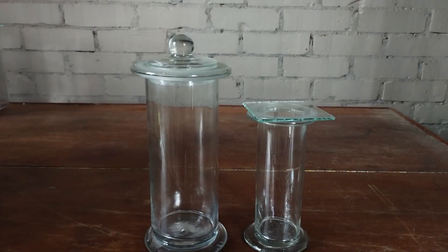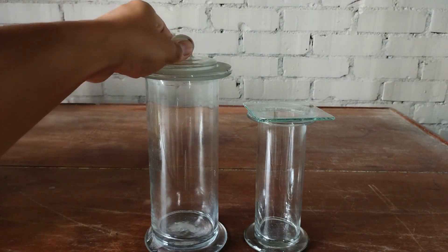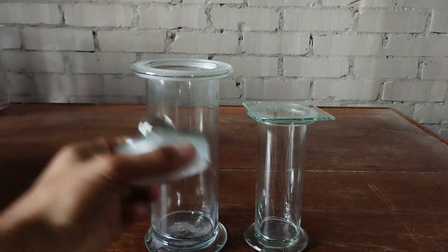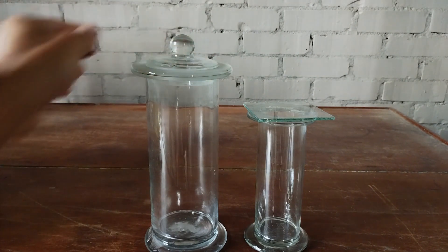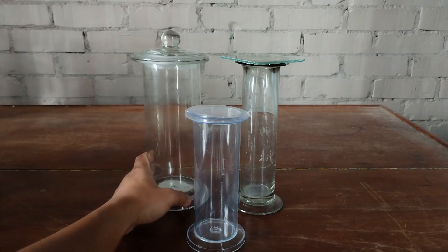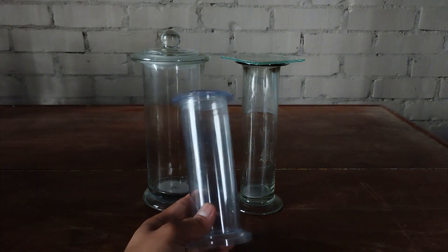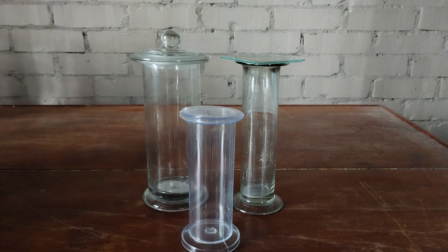There are also specimen jars based on the design of a gas jar where the cover is a more sophisticated kettle lid type design with a tight-fitting ground glass joint and a knob handle, like the one shown here. Most of the 19th and 20th century natural history collections, including those of the great Charles Darwin, are stored in these types of cylindrical jars. Gas jars are mostly made of glass — either borosilicate or soda glass — although plastic polycarbonate variants are also commercially available. Polycarbonate gas jars are however extremely prone to cracks and scratches, which hugely compromises viewing clarity and also results in leakage of the fluid inside.